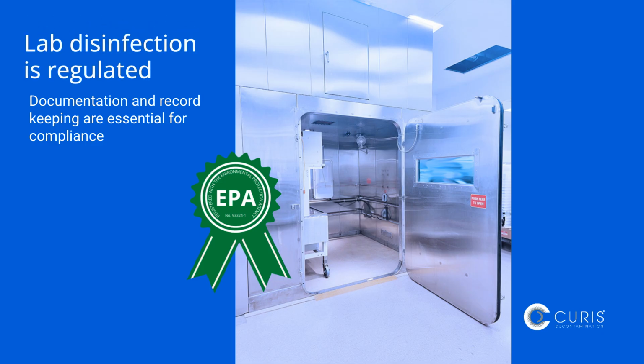Lab disinfection isn't just best practice, it's regulated. Organizations like the EPA, USP, and Annex 1 guidance frameworks provide standards that labs must follow depending on their environment and risk profile. Documentation and record-keeping are essential for compliance, audit readiness, and traceability, especially in regulated industries. Regular audits and process reviews help ensure your protocols stay aligned with evolving expectations.